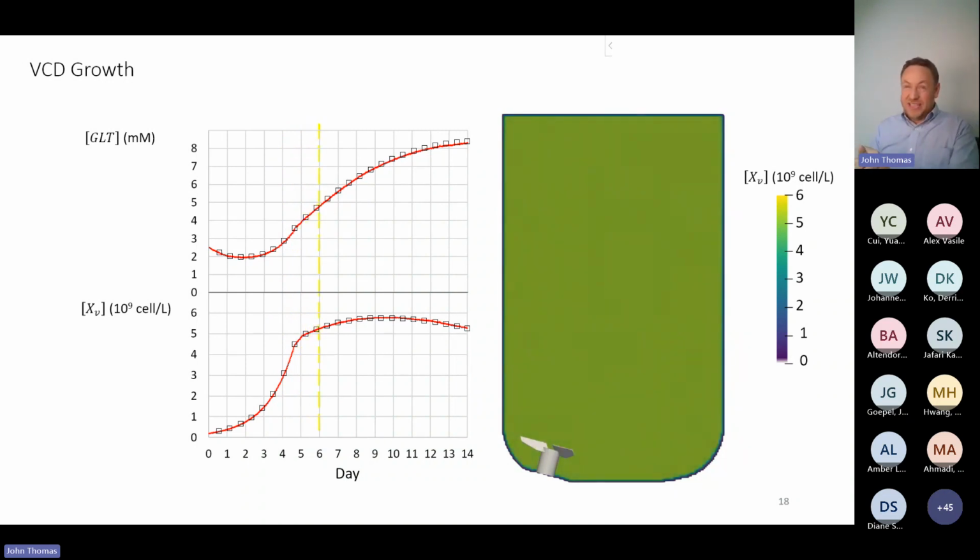I don't think I could model this as a 1-hour cell growth process, because at that point, the cell growth kinetics would have time scales comparable to the PID controllers and blend time, and that'd be really weird. But inasmuch as my biogrowth process is in days, I'm on good legs to stand on when I'm exploiting my non-dimensionalization. But here again, despite these complex feeding and growth profiles, we're seeing pretty homogeneous cell growth throughout the maintenance phase, and this all looks well and good.